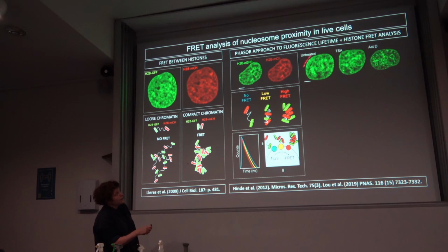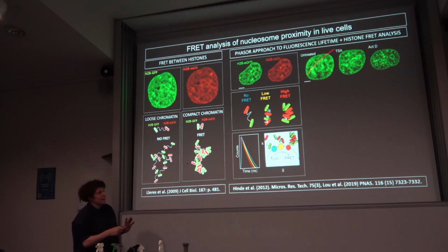So I won't go over how we perform the analysis, but here is a human cell's DNA in green. And here's the cell where it's just normal. I haven't done anything to the DNA. This is how it would regularly be. I then treat the cell with something that opens up the DNA into this more open state. And I've treated another cell with a drug that compacts all the DNA into this compact state.